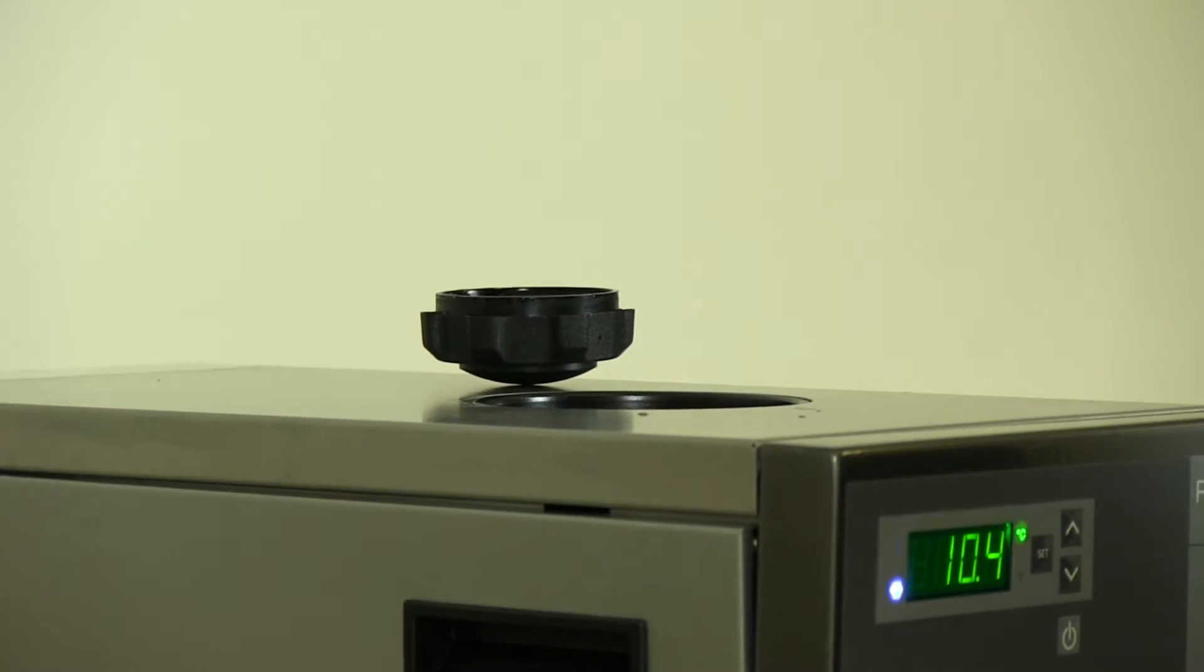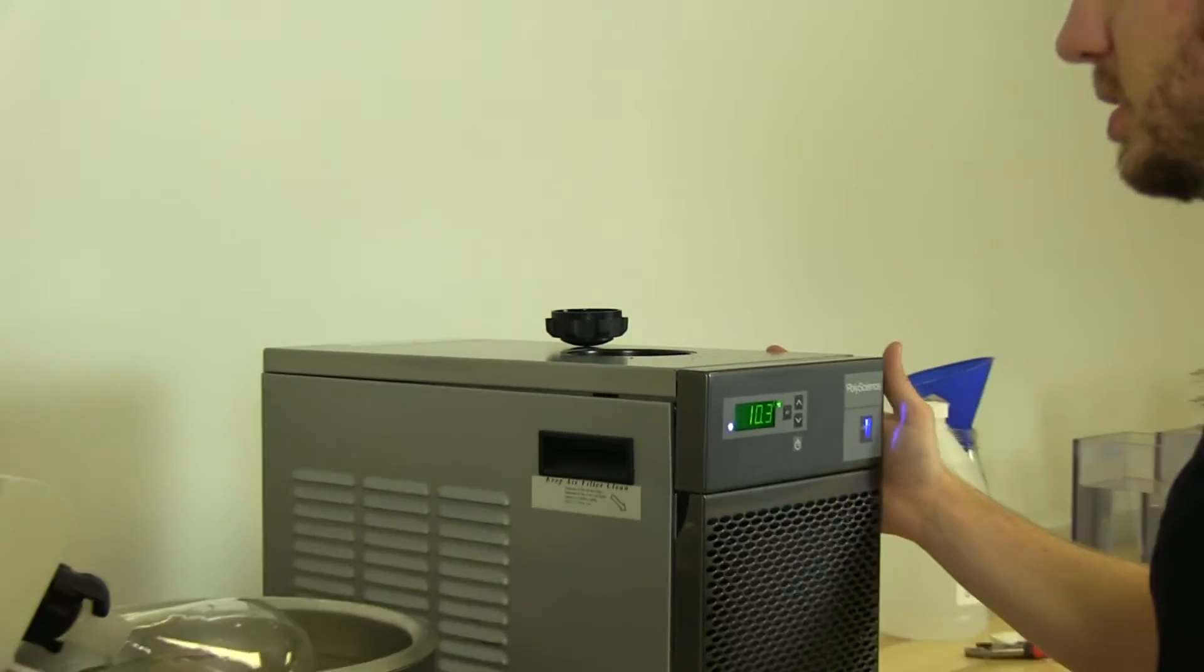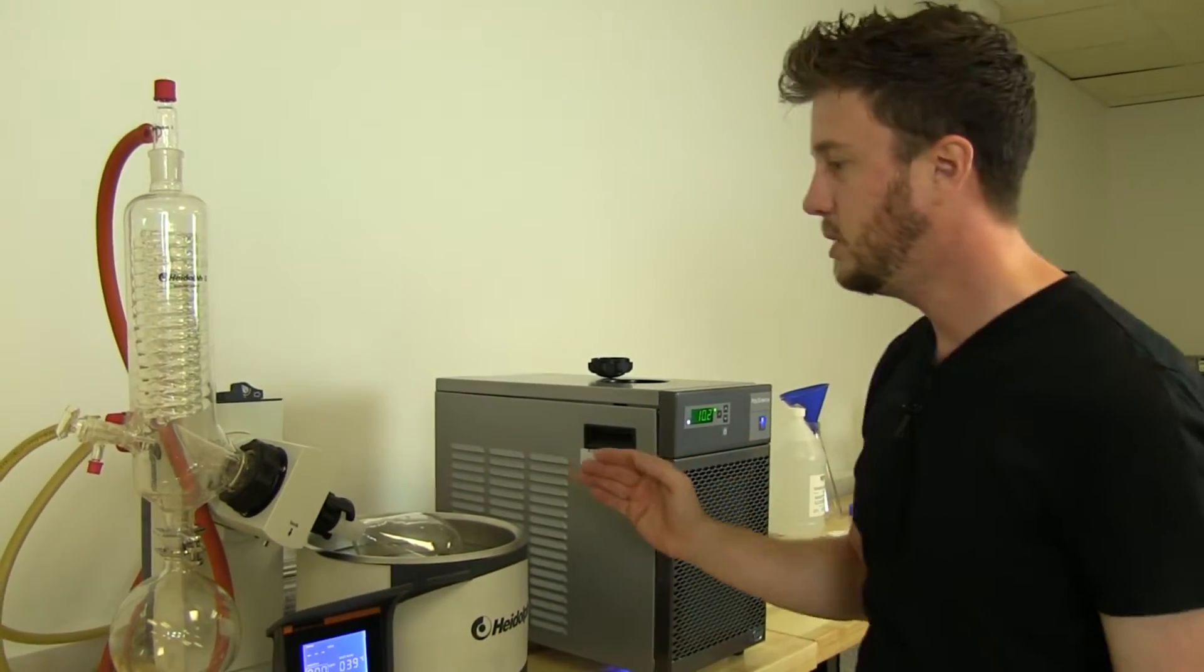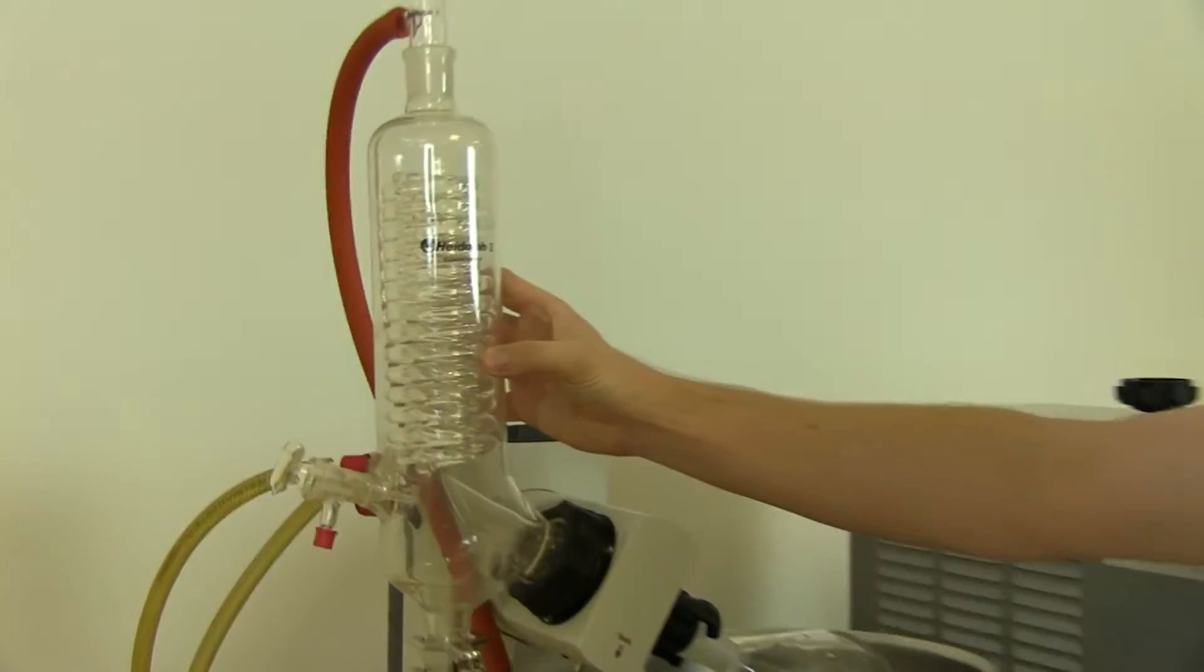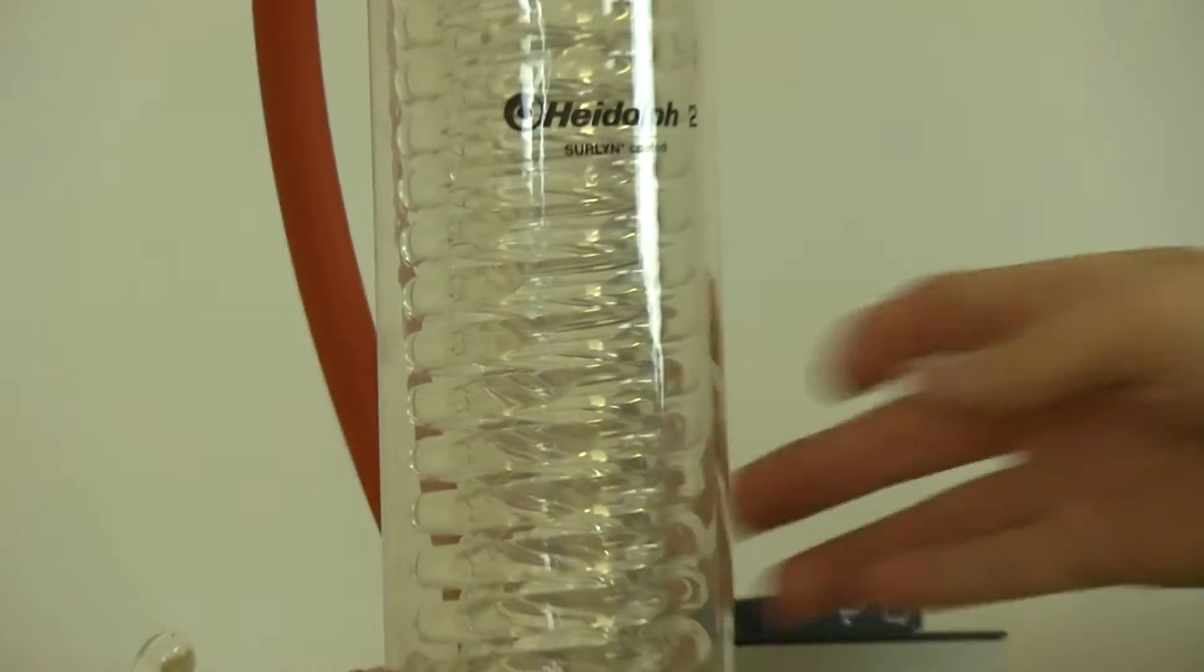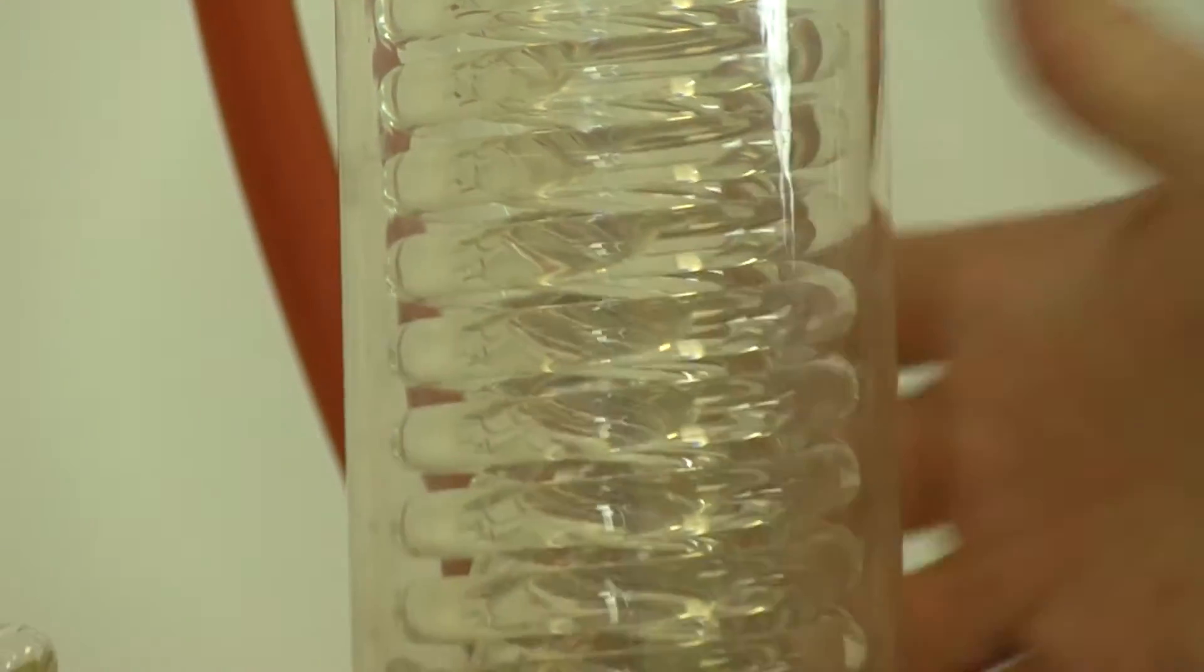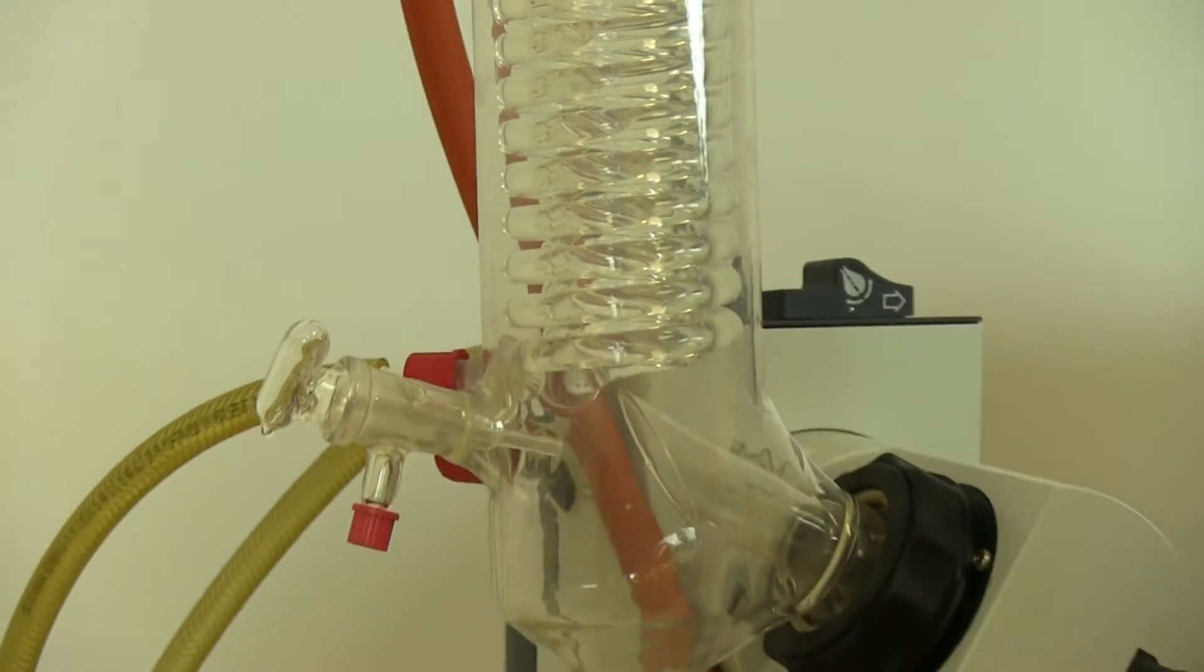So we fill the reservoir all the way up with water, we let the system settle, it starts to circulate through the condenser coil here. It's a good time to monitor any of your connections for leaks on your glassware and on the rear of the chiller.